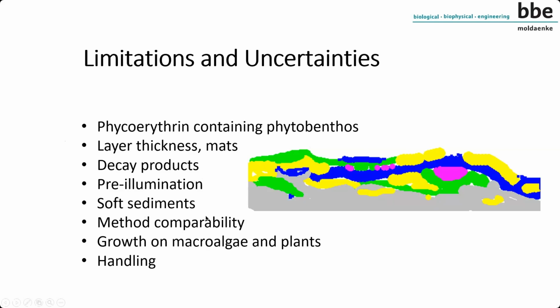The other thing, of course, which I mentioned already before, is the comparability of methods. We have different kinds of methods that can be used, and it's clearly to discuss how we can compare this. We have, for example, the intake of C14 into the biomass and measure this. We have the measurement of wet material. So then we cannot easily compare all these methods and make it clear.